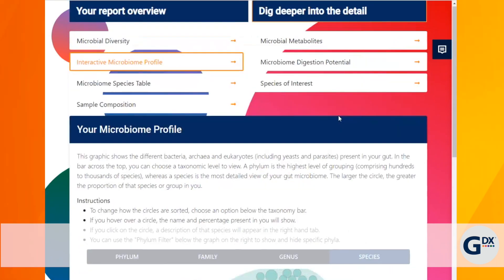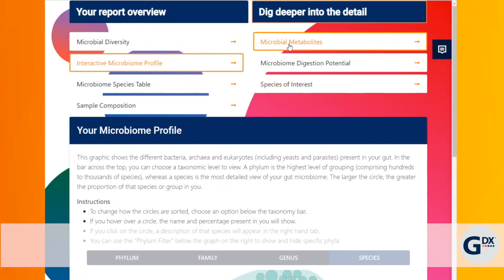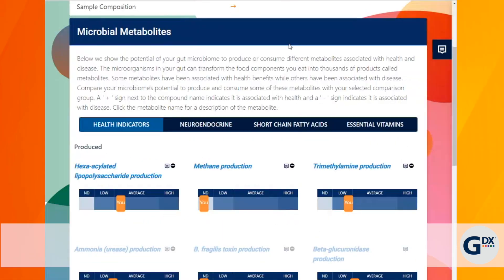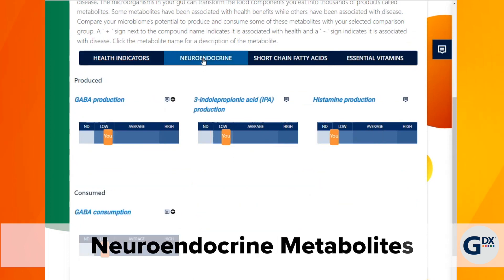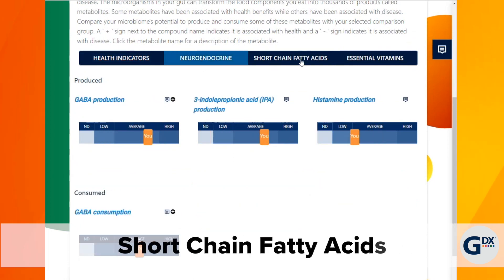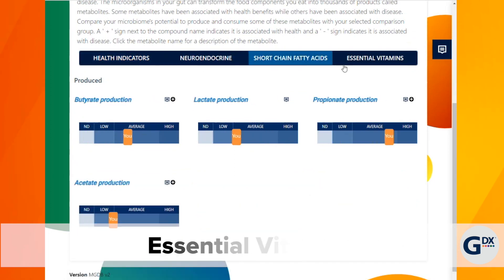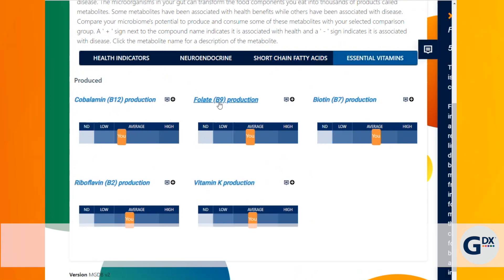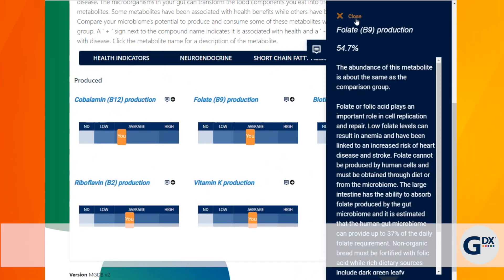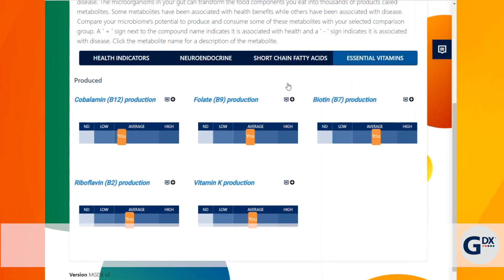The microbiome's potential to make important microbial byproducts is reported as health indicators, neuroendocrine metabolites, short chain fatty acids, and essential vitamins. Click to learn more about each metabolite and see if it is associated with good or poor health.